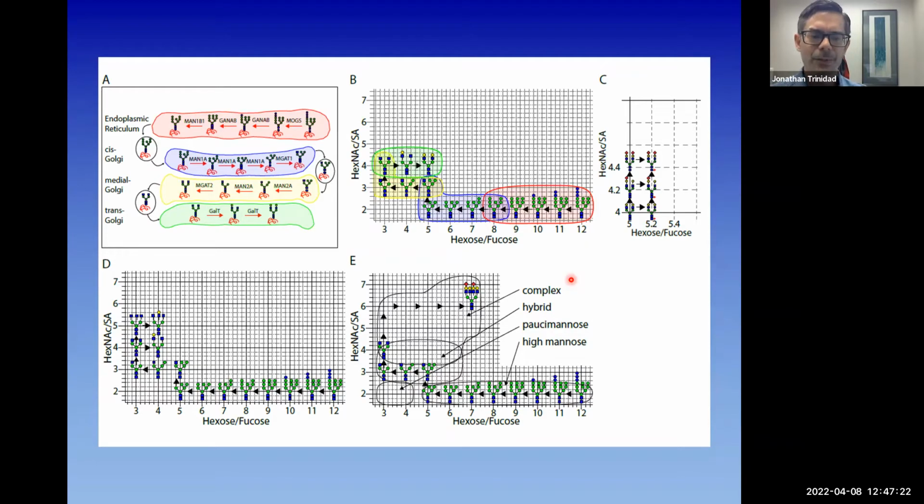But it was really hard to connect the large scale nature of the data back to some biology, right? You could look at the time course of things and group them by who's early, who's medium, and who's late in terms of response to your stimulation. And maybe that correlates with the underlying kinases that might be active. But you get to that point and you're kind of stuck.